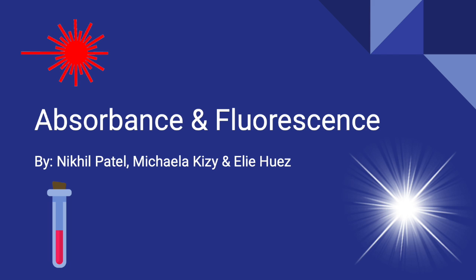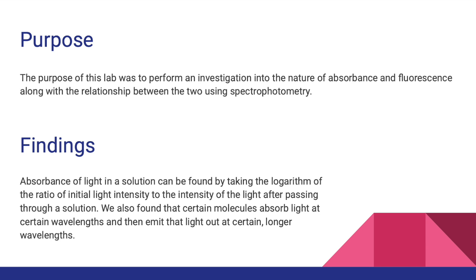Hello, my name is Eli, and my group mates are Nikhil and Michaela, and this is our absorbance and fluorescence experiment. So the purpose of this lab was to perform an investigation into the nature of absorbance and fluorescence along with the relationship between the two using spectrophotometry.